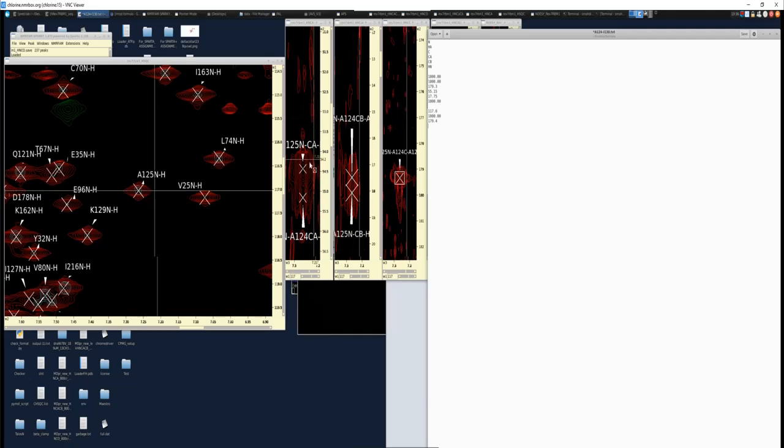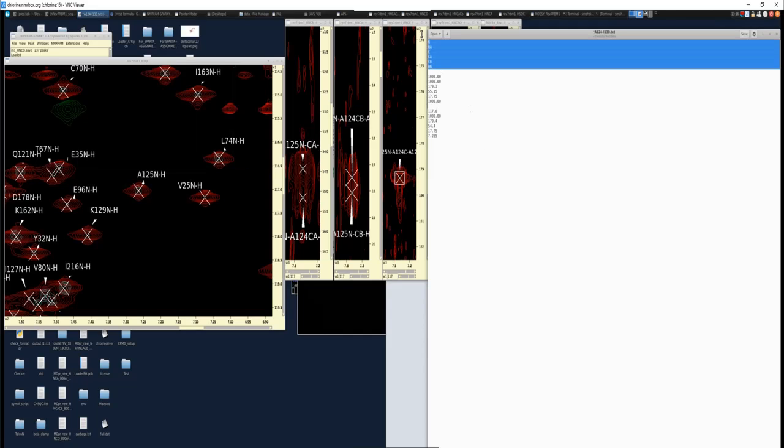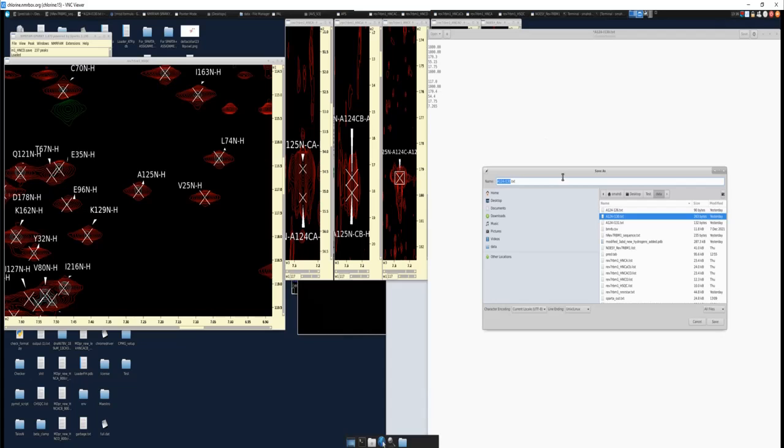We do have an I C alpha, 54.4. And again, we don't know which one of these two is the I and which one's the I minus 1, so we'll pick the average of the two. And finally, the amide hydrogen, 7.265, right? So let me get rid of this top portion, and we'll save this as the unknown.